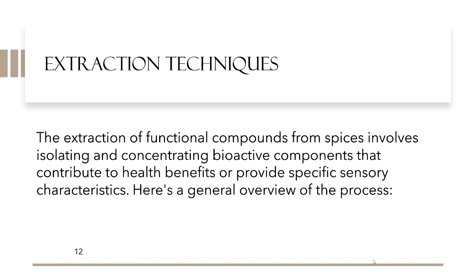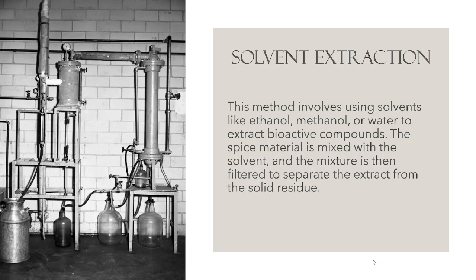The various methods for the extraction of functional compounds are solvent extraction, steam distillation, microwave assisted, and ultrasound assisted extraction. So let's start with solvent extraction.